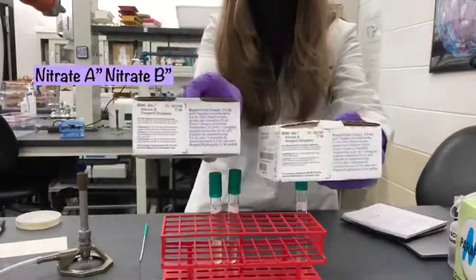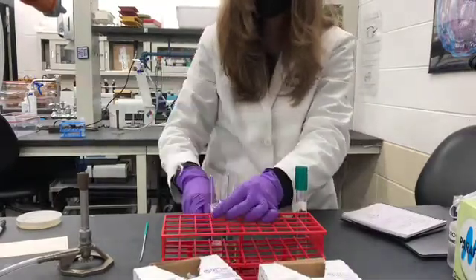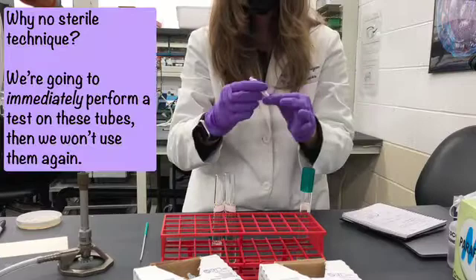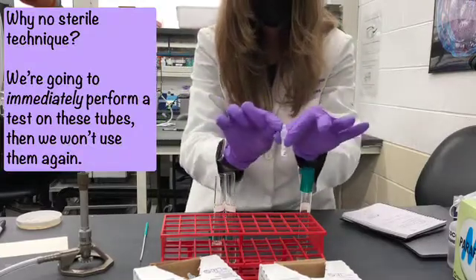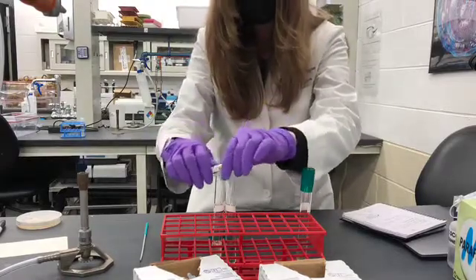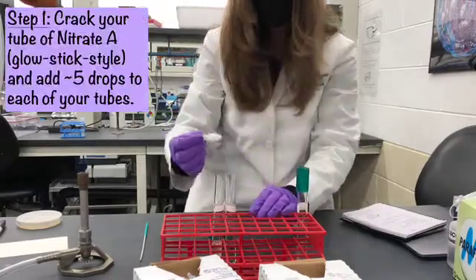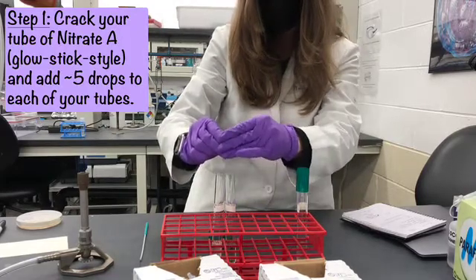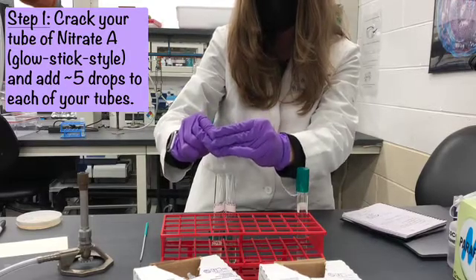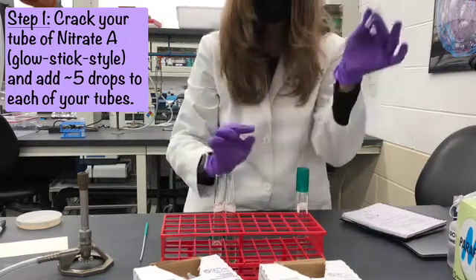We call one Nitrate A and one Nitrate B. These tubes have an open dropper on top and a glass vial on the inside. You crack them to break the glass, and then you can just drop the reagent into the solution without removing the lid. You want to count the drops — about five drops of Nitrate A into each sample.